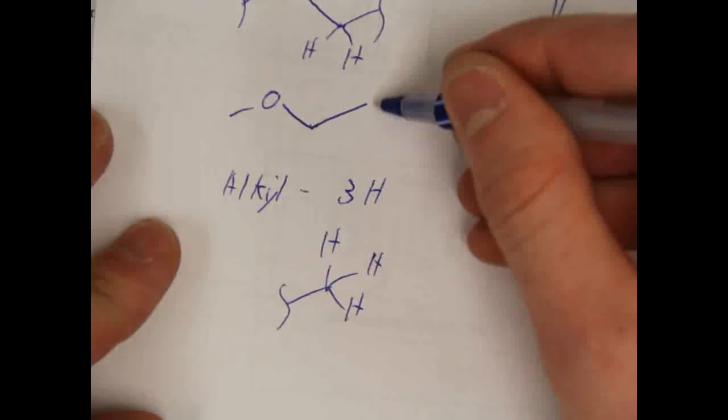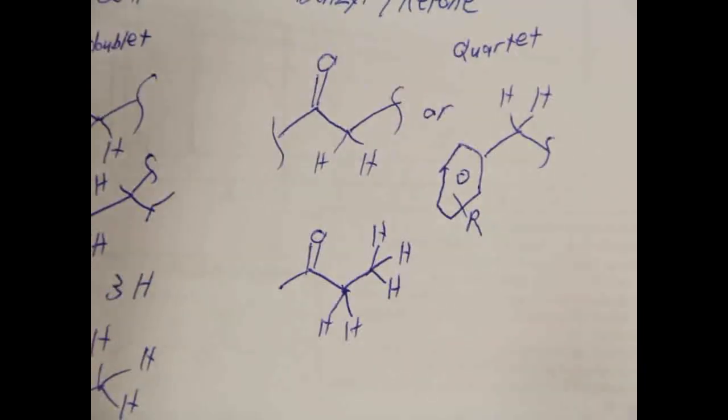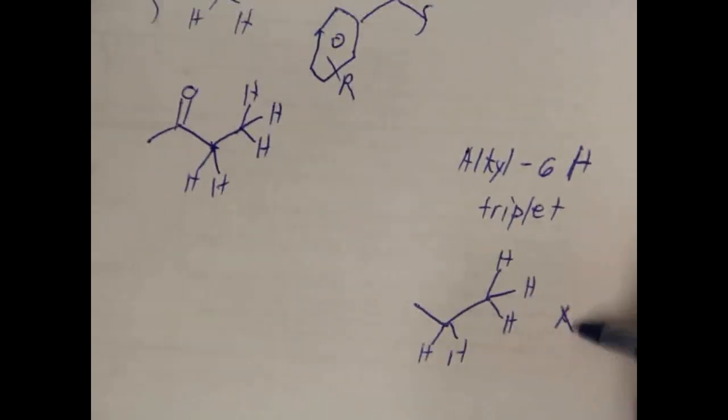Now, it's time to turn back to your scrap paper and build on your earlier structural fragments. Make small 2 to 3 carbon chains and simple ring systems.